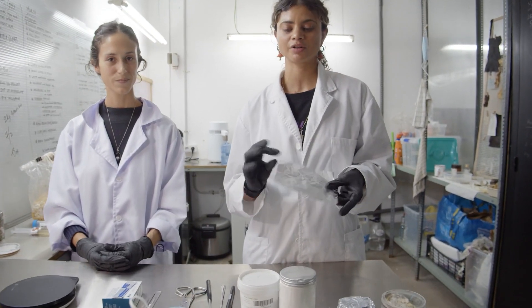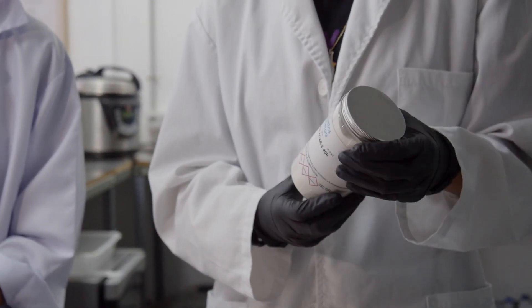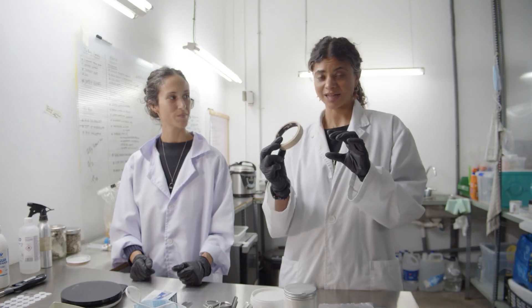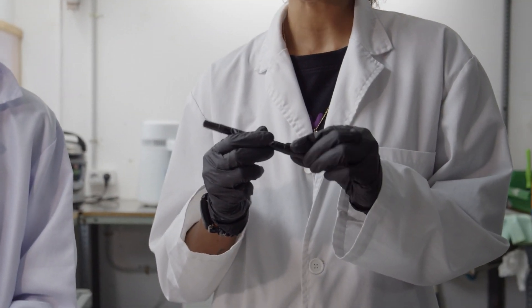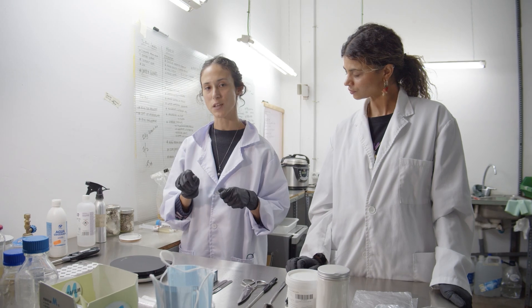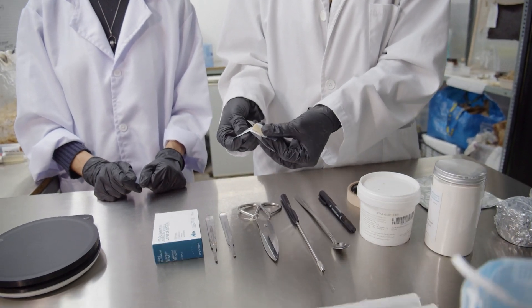Other tools and materials you might find in the lab: aluminium foil to cover samples, jars, or plates going in the pressure cooker; agar, which is a non-nutritious media that creates a jelly-like material used in cooking; syringes for liquid cultures; tape for labeling or covering samples; a pen or sharpie to document everything; metal spoons; and an inoculation loop, used for bacteria transfers and transferring spores or spore prints onto agar.